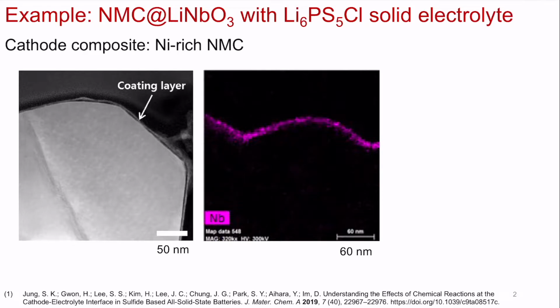So I don't have the composition here because the paper does not actually report a composition, because this is out of Samsung. So for obvious reasons, they don't report the stoichiometry, the particular chemistry. But that is a minor detail when it comes to this analysis. So what you see here is the NMC sample, and the coating layers outlined in the elemental analysis.